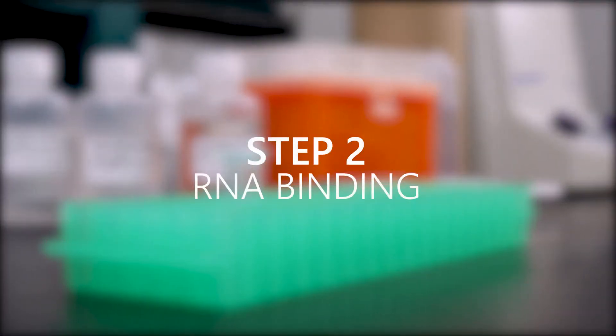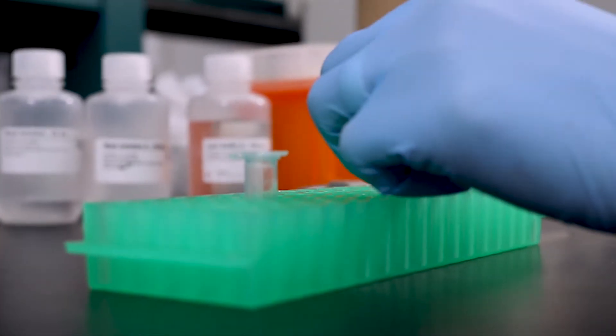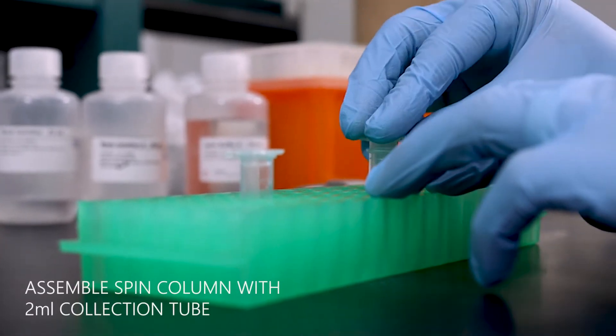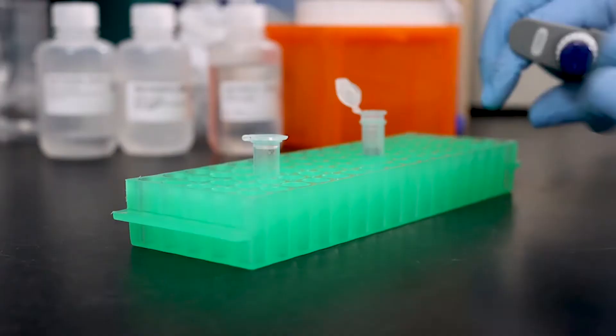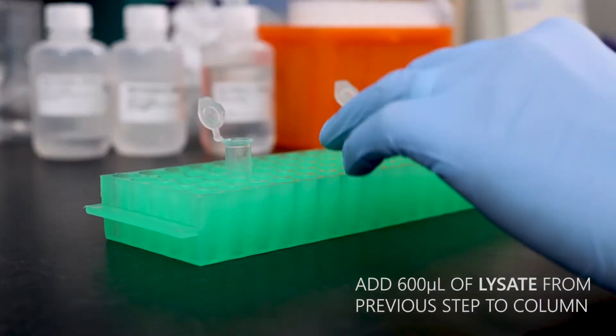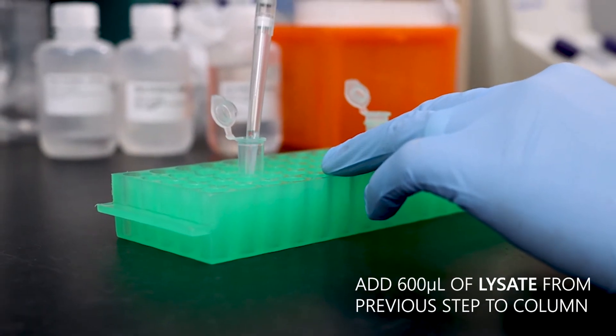Step 2. RNA Binding. Assemble the spin column with a 2ml collection tube. Add 600 microliters of lysate to the spin column.